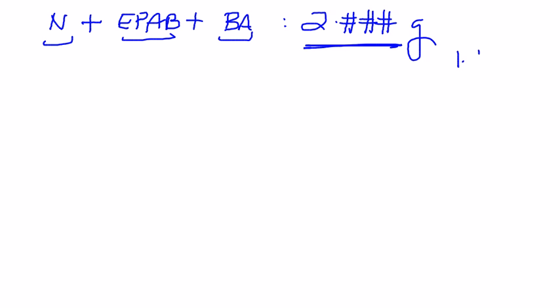It can range somewhere between 1.9-ish to about 2.1-ish or so, but you should know exactly what you're beginning with, because in the end you are going to report a percentage recovery of each of your components, and realize that all those three should add up to the 2 grams that you are beginning with. So it's in a specific ratio, like I said, but all of those should add up to the 2 grams.